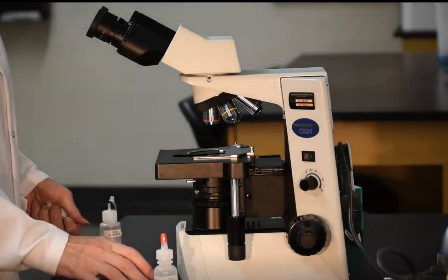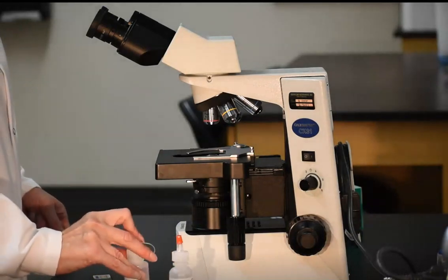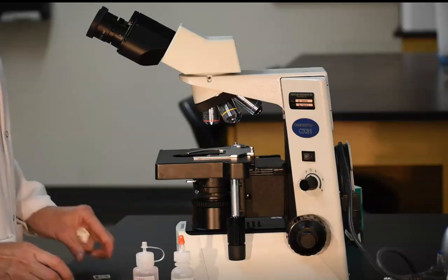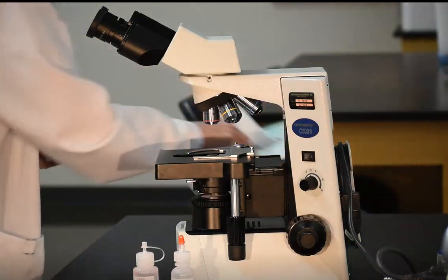If the slide is a prepared slide, you will wipe the oil with a lab tissue, such as a Kimwipe. You can follow this with a drop of lens cleaner.